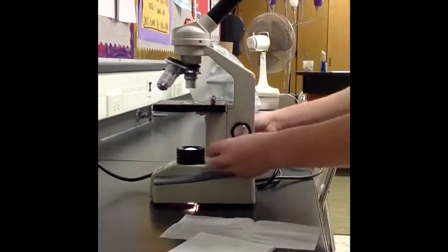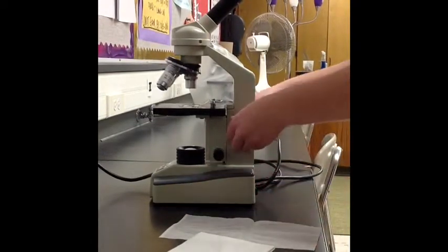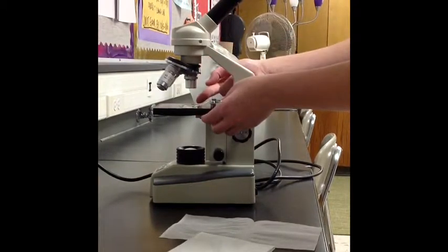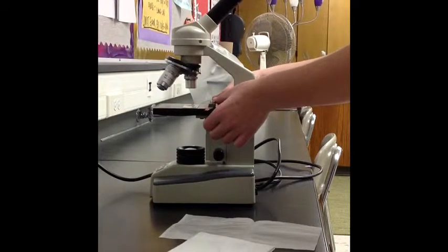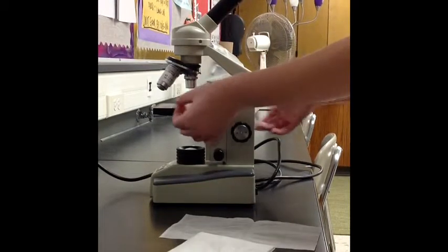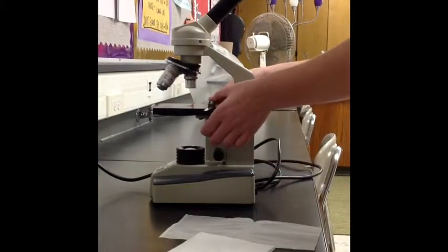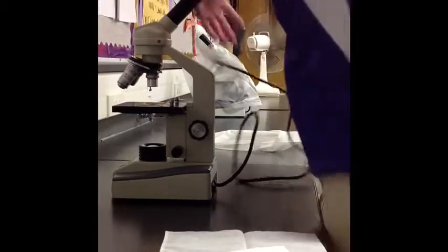When you are finished observing the slide, shut off the microscope and lower the stage all the way down. Then rotate the nosepiece back until the smallest objective lens is above the slide. Move the stage clips off and carefully remove the slide. Now put the stage clips back in place. After that, wrap the cord around the bottom of the microscope and put the cover on.